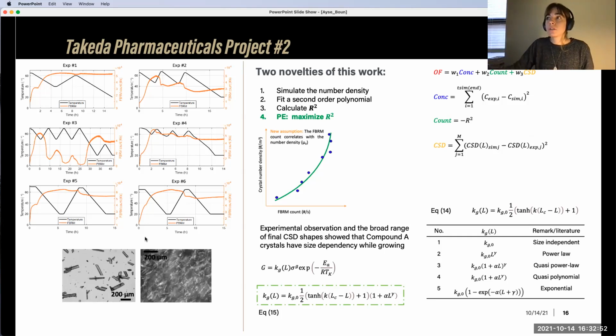But that was good because this is research, you need challenges. So for this experiment, for this work, I didn't do the previous experiments, I didn't do the control experiments. So I basically designed some experiments with different cycling, with different temperature profiles, because now we know we need cycles to grow these crystals up to a certain point.